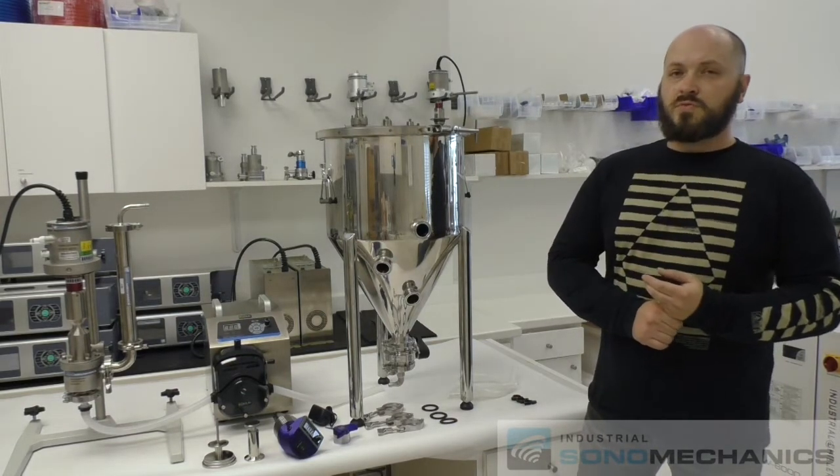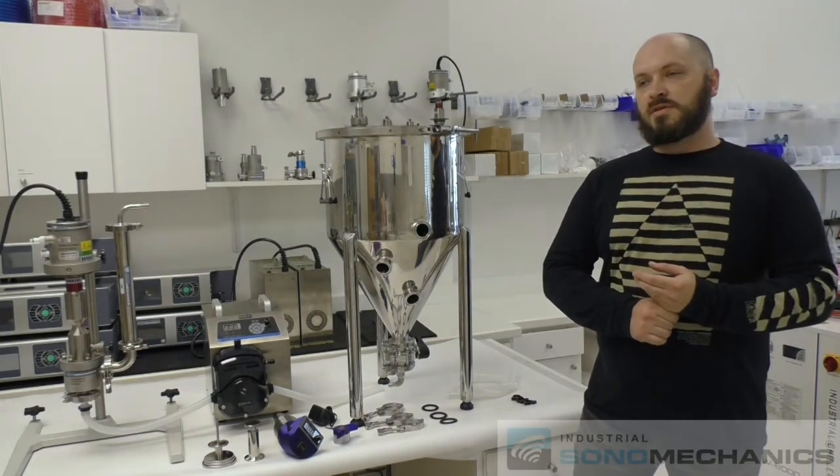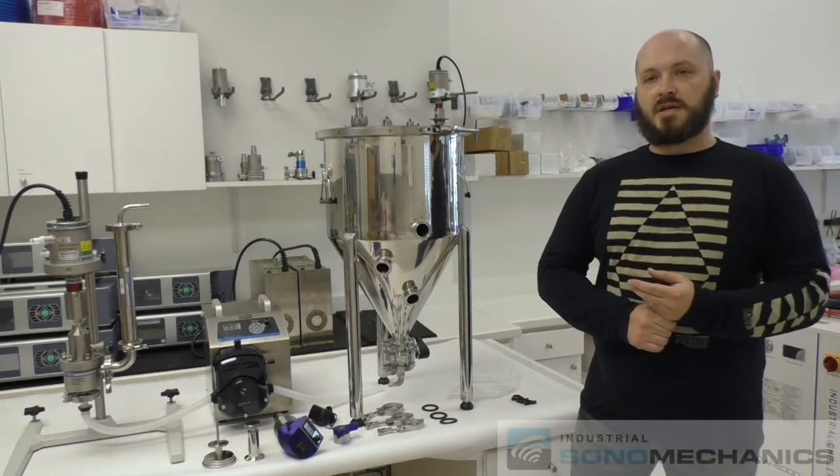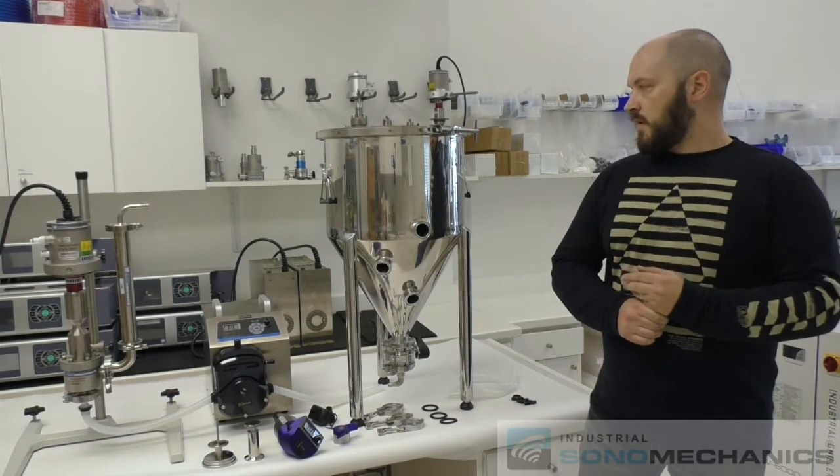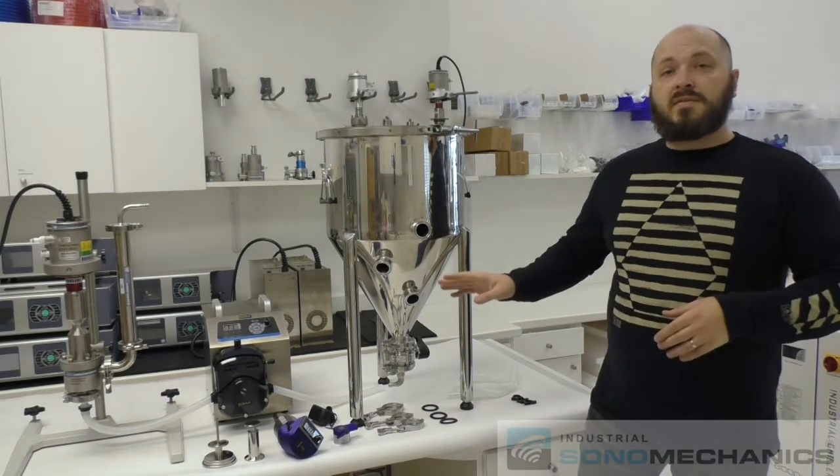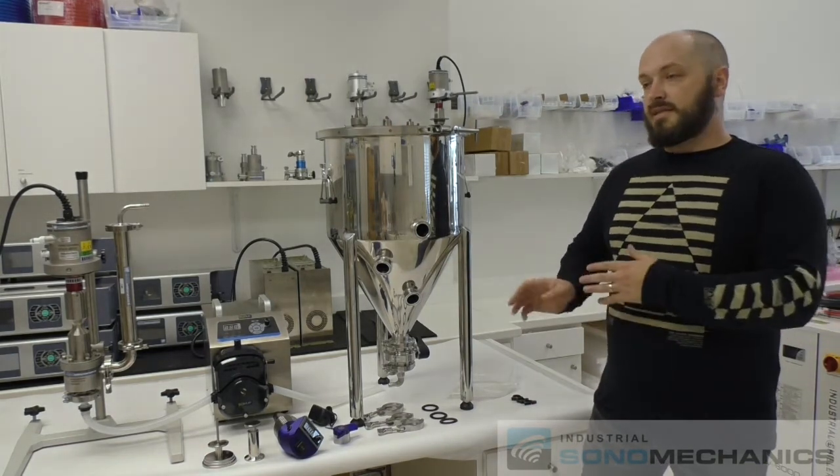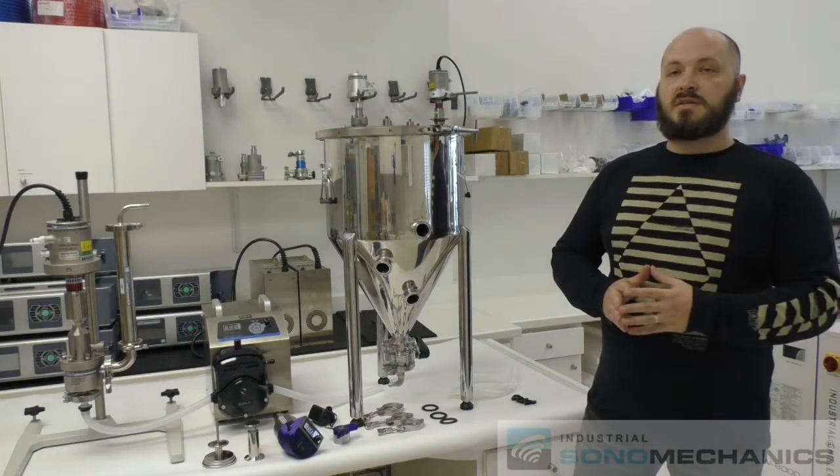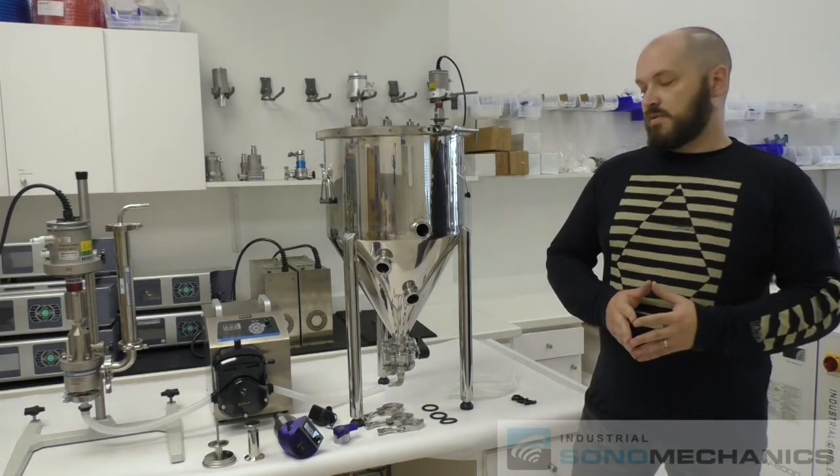This tank can be used with our ISP3000 system or BSP1200 in the flow-through mode. We also offer a 25 liter version of this tank and the assembly for that tank is exactly the same as this one so you can use this video as reference.